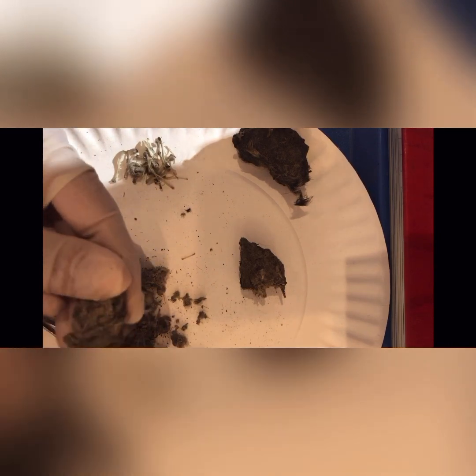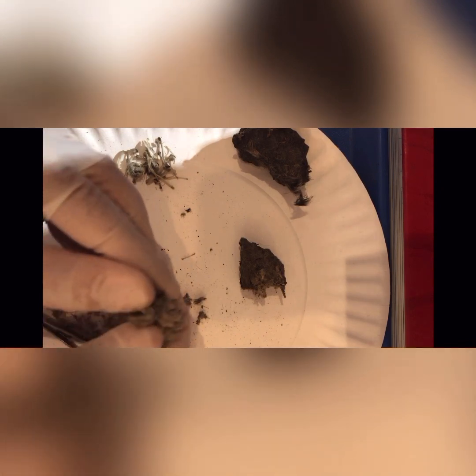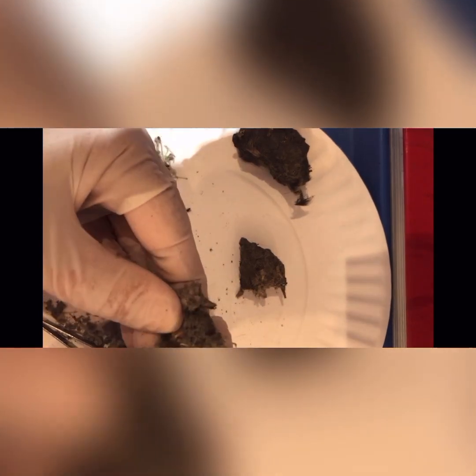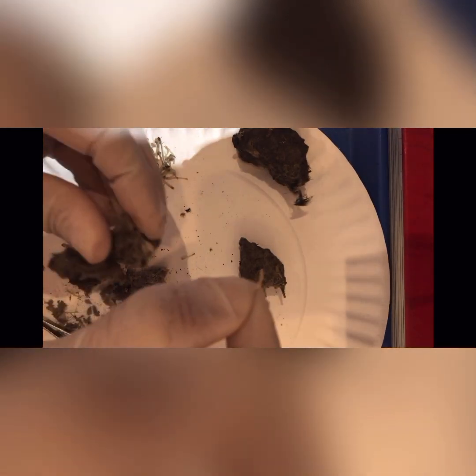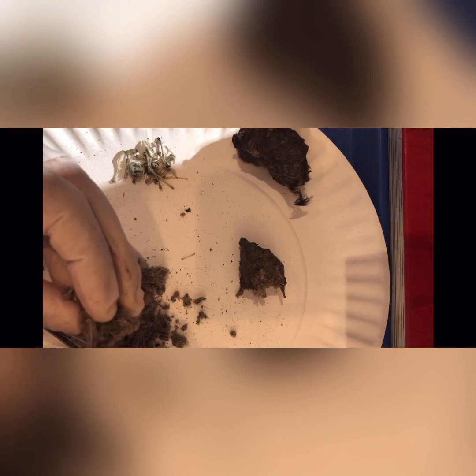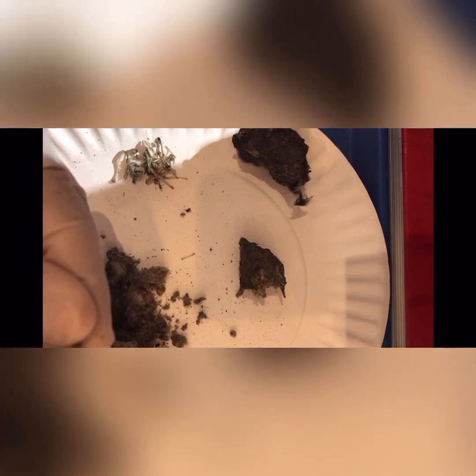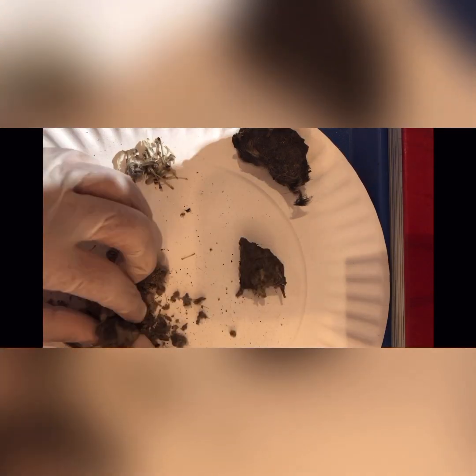Keep going. I don't see a skull in here, but it might be in the other part. Oh, and I think I just cracked something. Let's see if we can break it apart. And it looks like another part of a jaw. I'm gonna put that to the side. Oh, and this, I know what this is. This is part of the scapula. So I'll show you guys later the bone chart.